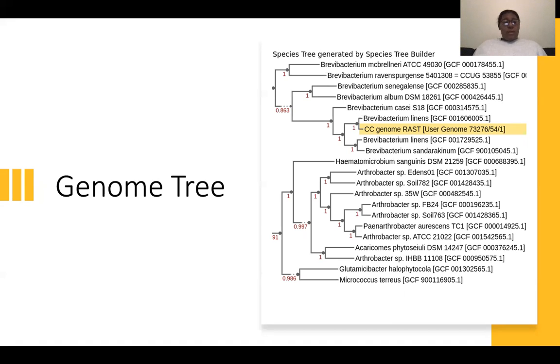kbase.us also provided me with FastANI software, which stands for Average Nucleotide Identity. It was completed with my genome and its closely related relative to determine the genomic similarity between the two. ANI's purpose is to compare DNA to determine relatedness.